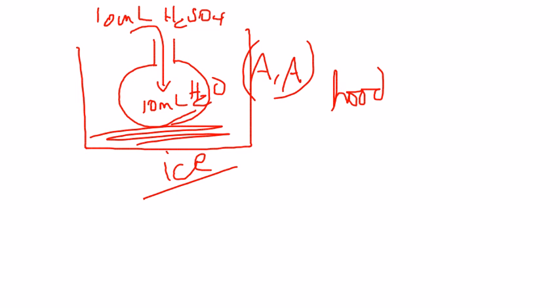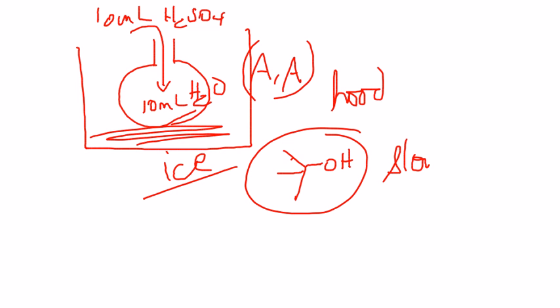So that means that, the second step where it says cool the solution to 50 degrees in an ice water bath. Since you already have it in ice, that temperature would actually never even reach 50 degrees. So even if you're at 20, 30, that's okay. So you can probably ignore step number 2. At this point of time, you would then add slowly with continuous swirling. You're going to add the alcohol, the T-butanol, and you would do that as a slow addition.